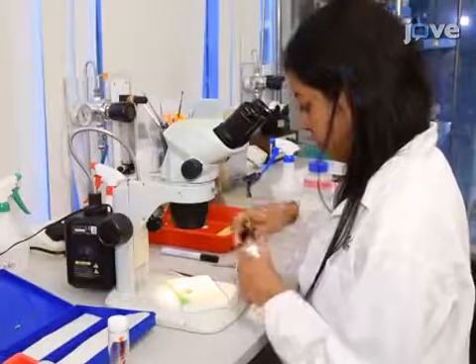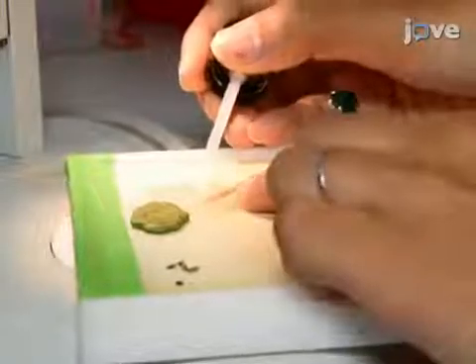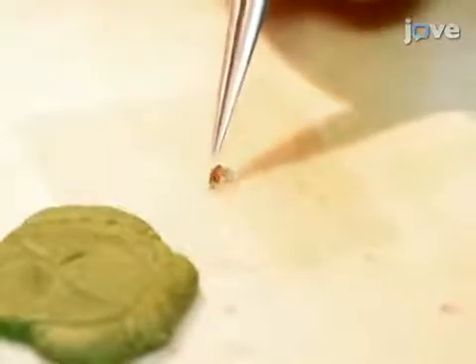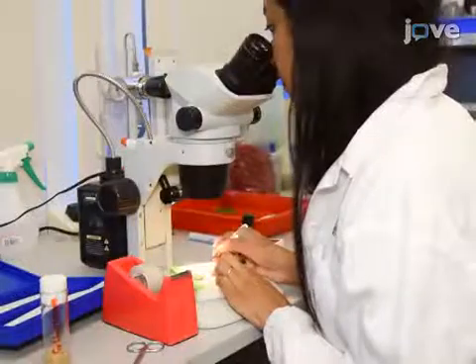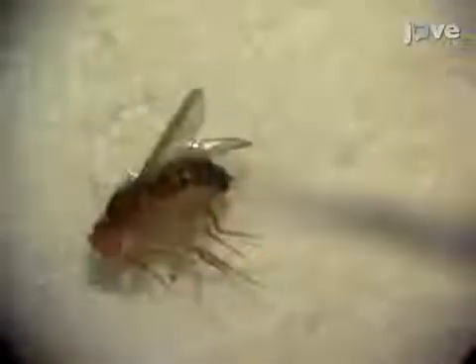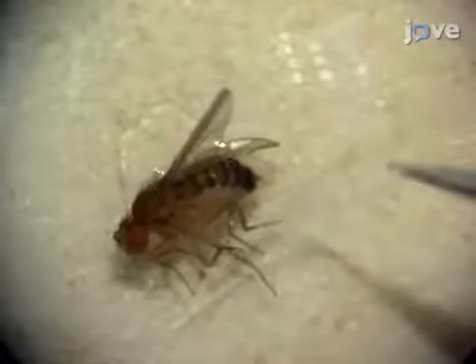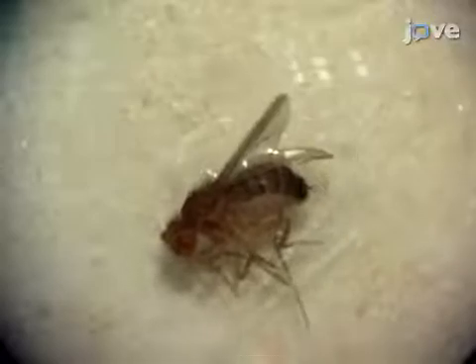After anesthetizing the fly, attach it to a 0.17 millimeter cover slip using a very small drop of clear nail polish. Attach the side of the fly to the slide using the entire drop. Next, under a dissecting microscope, use a wet paintbrush to extend a foreleg of the fly. Then, using two very thin strips of tape, secure the first and fifth tarsal segments to the cover slip.